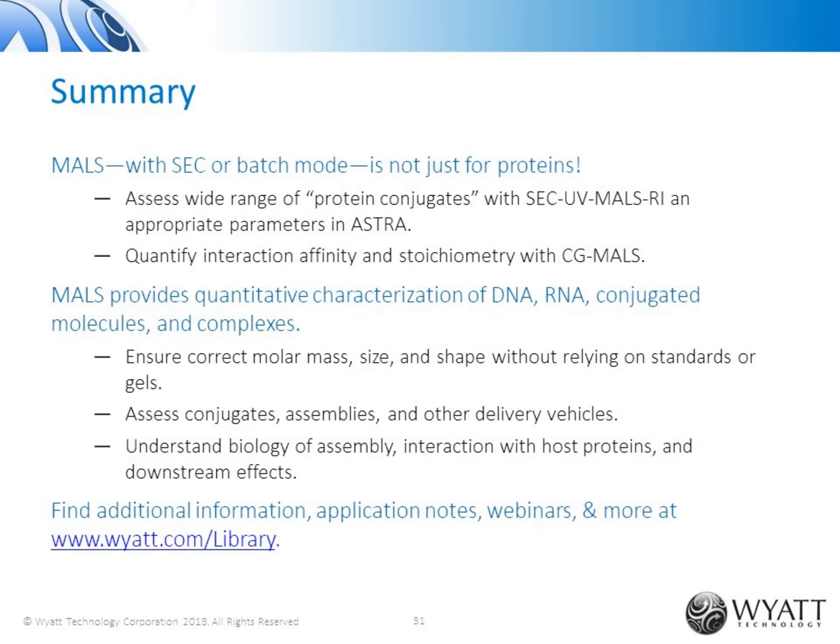Is there a generic dn/dc value for DNA, RNA, much like there is for a protein? And how accurate do these values need to be for conjugate analysis?